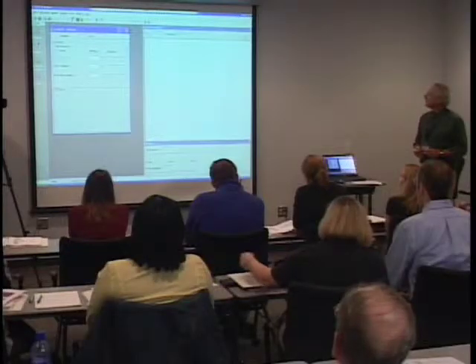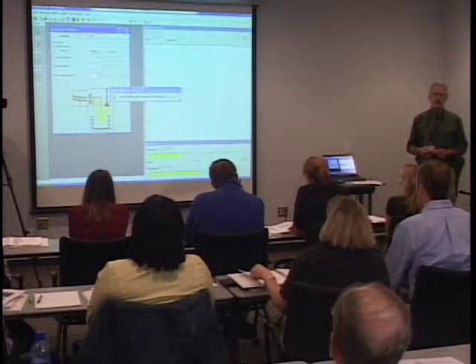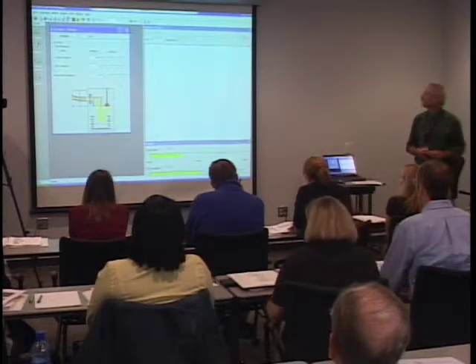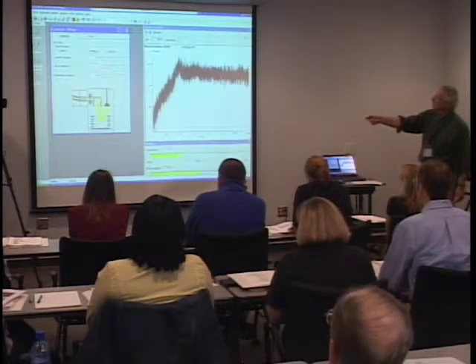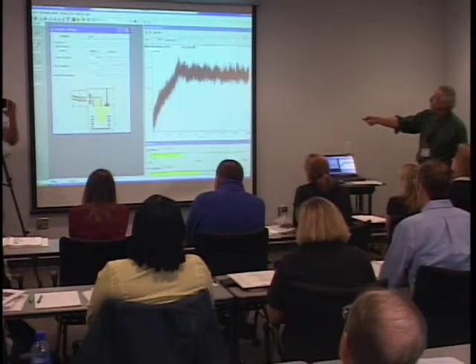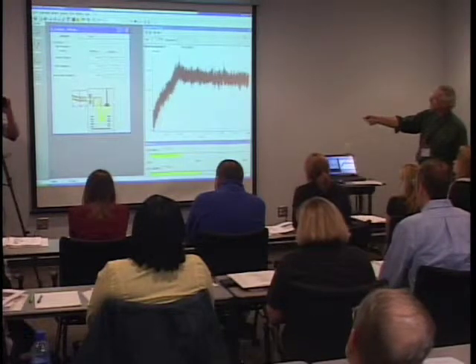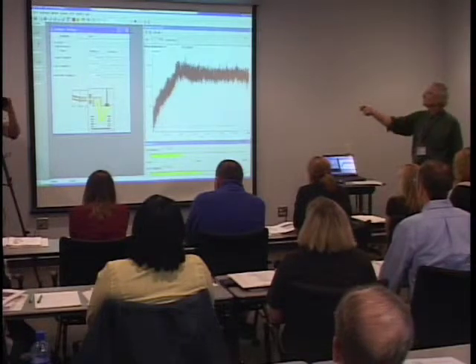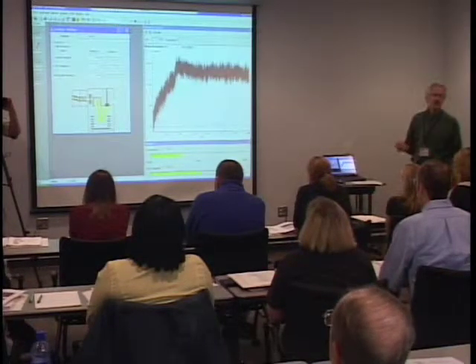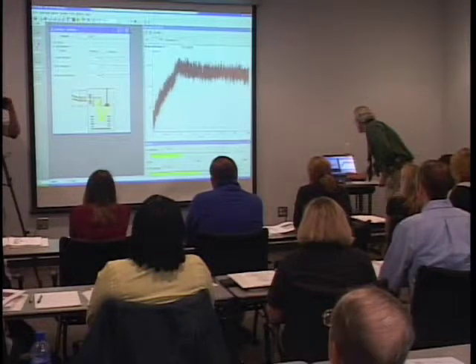Clicking the icon opens another page showing a little diagram of the instrument and subparameters. There will be a lot more parameters than you actually need to worry about — I'll point out the ones that are important. The most important thing is there will be a window for the analyzer and for the source. We're only going to look at two parameters on each of those pages. The instrument is currently in warm-up mode, not operate mode. We'll go up here and turn the instrument to operate mode.